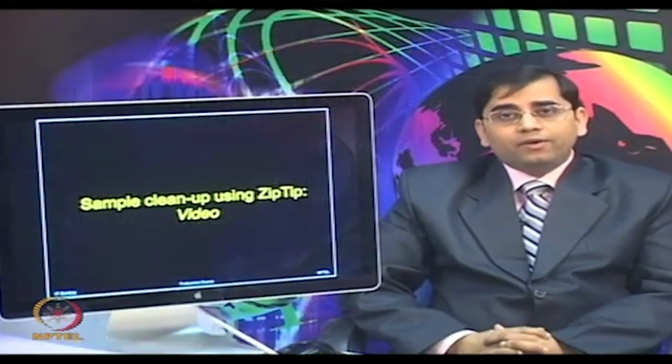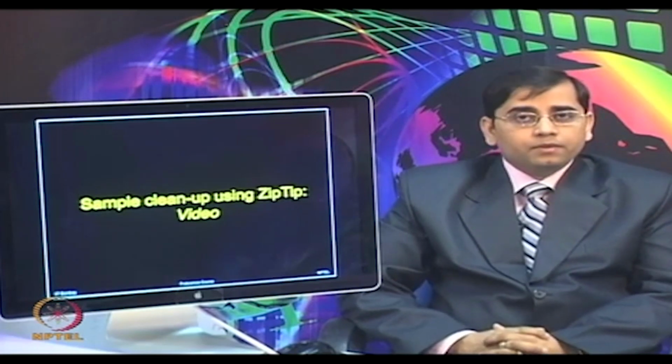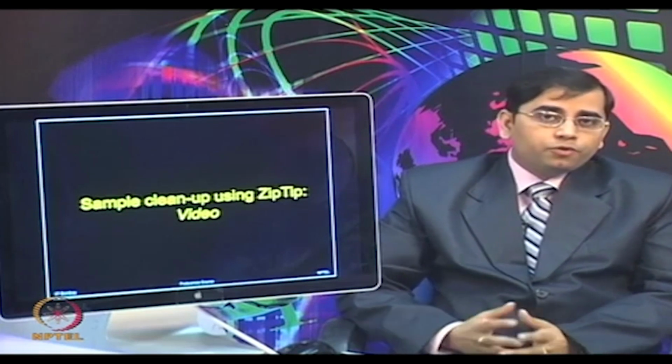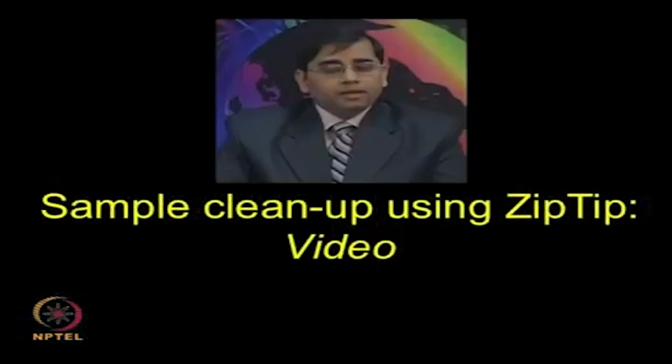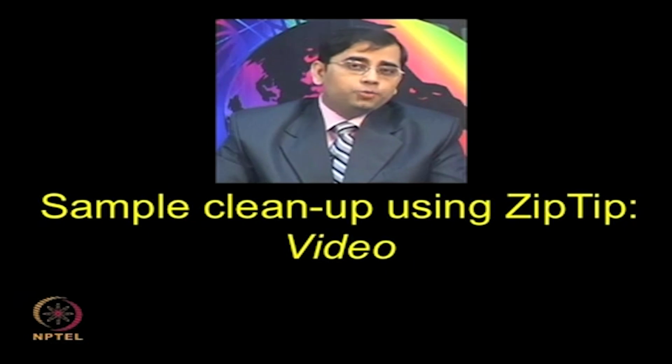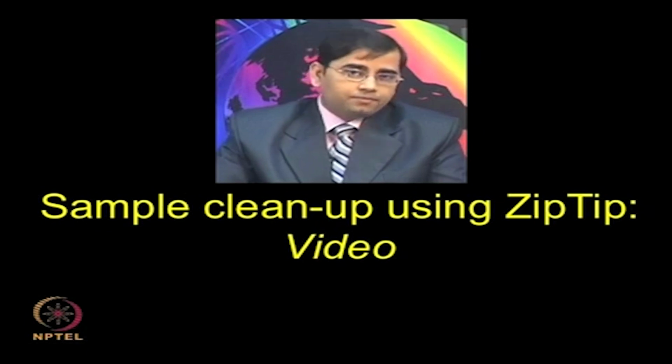So, this zip tip is a very small tip-like device for removal of salts as well as other interfering components from the protein sample, and it is performed before injecting the sample for mass spectrometry analysis. The zip tips can be incorporated into high throughput robotic devices or multi-channel pipettes for high throughput applications.